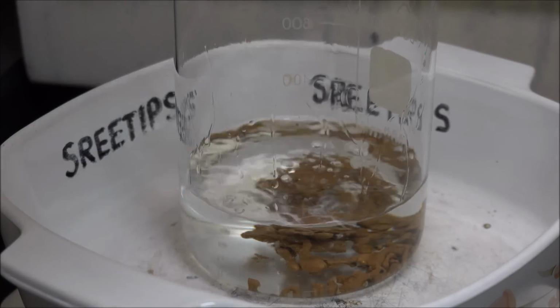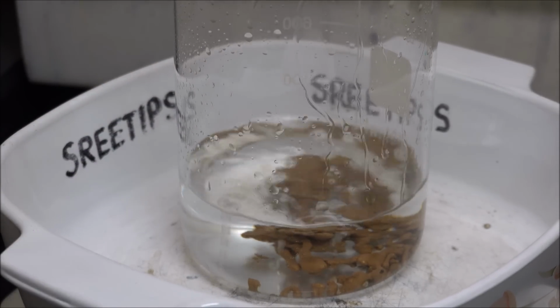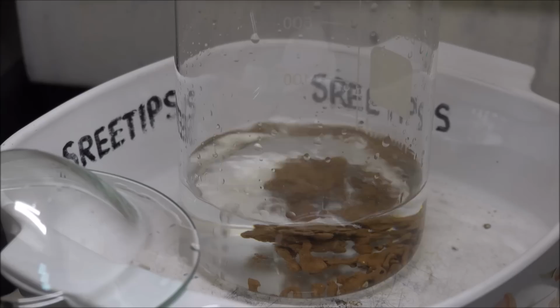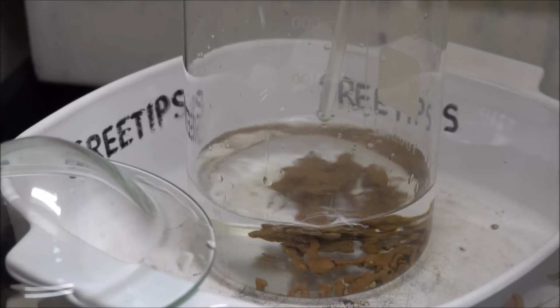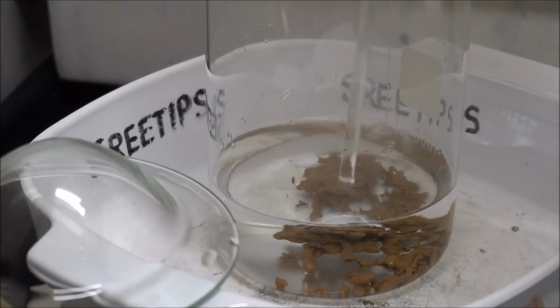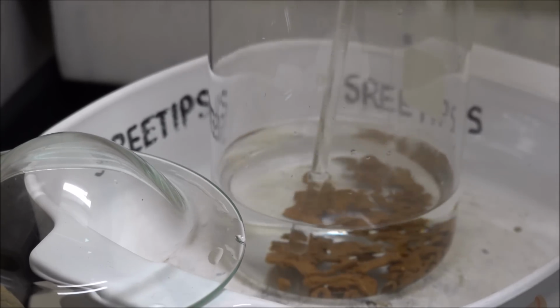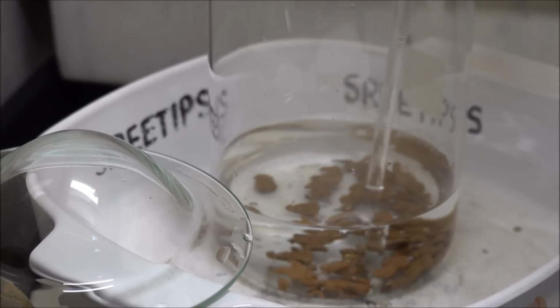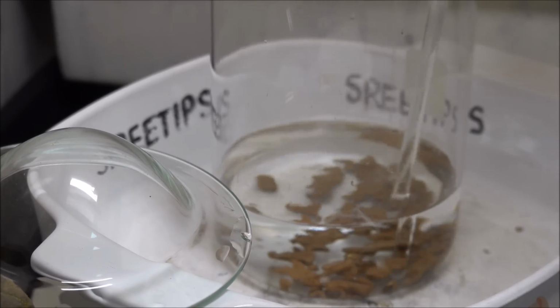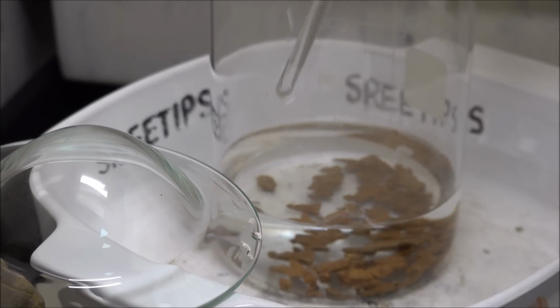This is hot dilute nitric treatment number 5. And I'm going to do something you should never do. I'm gonna stick a glass rod in here and I'm gonna crush one of these nuggets. Make sure we don't get a burst of reaction from copper that's still in there. I don't see anything. So I think we're good here.